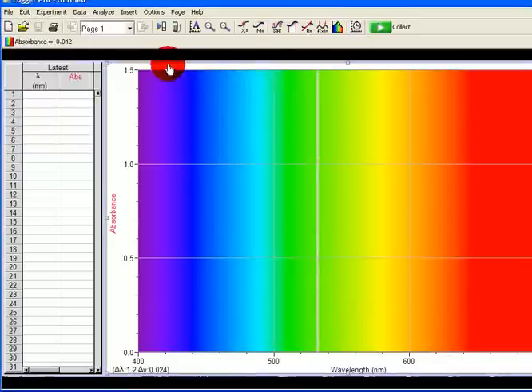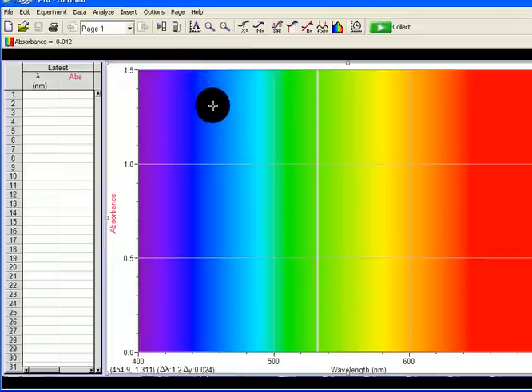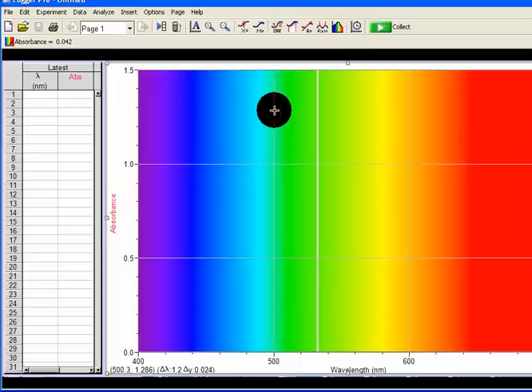This is a visible spectrophotometer and I'm going to show you how to use it to quantify, or to set up a standard calibration curve for a colored solution — cobalt chloride.